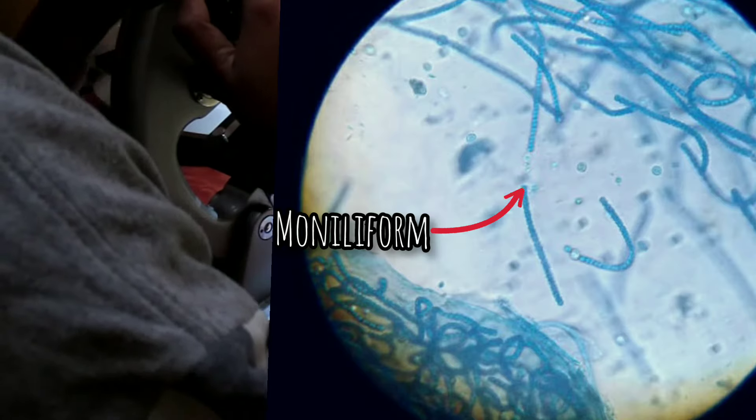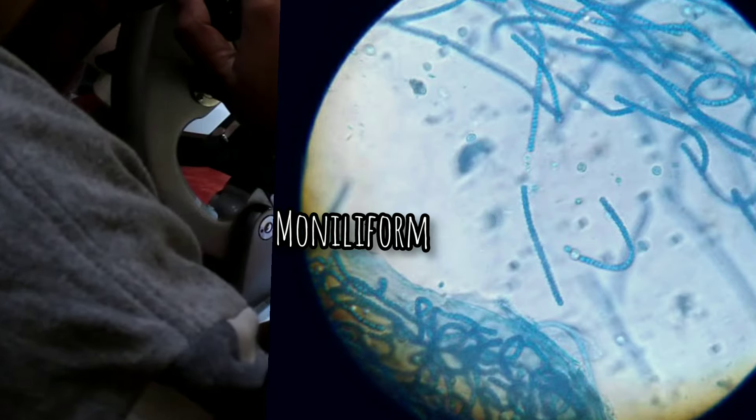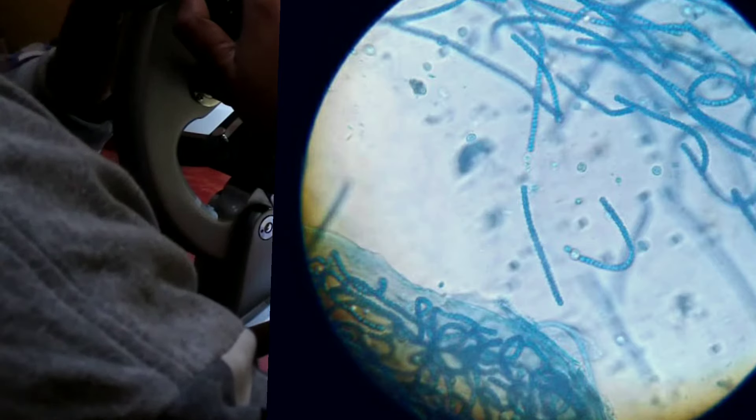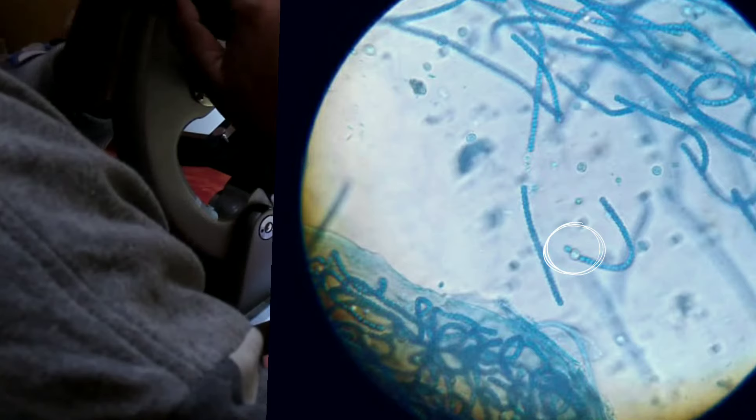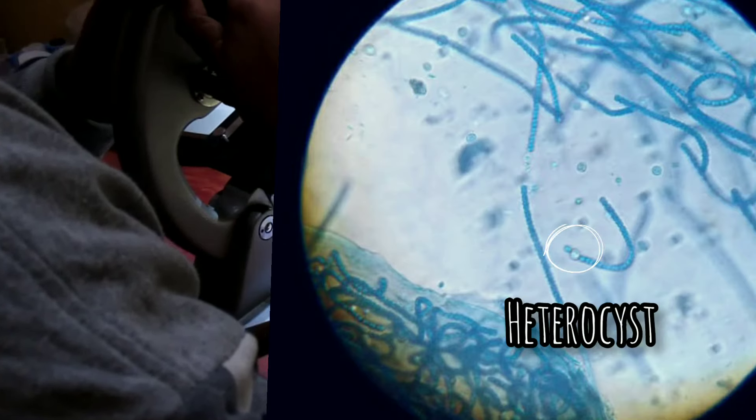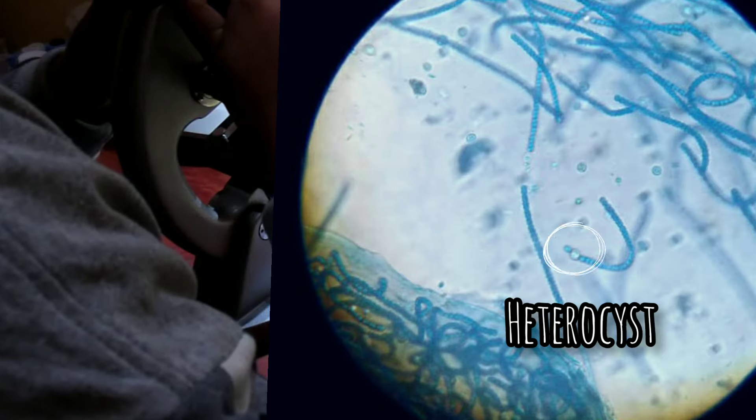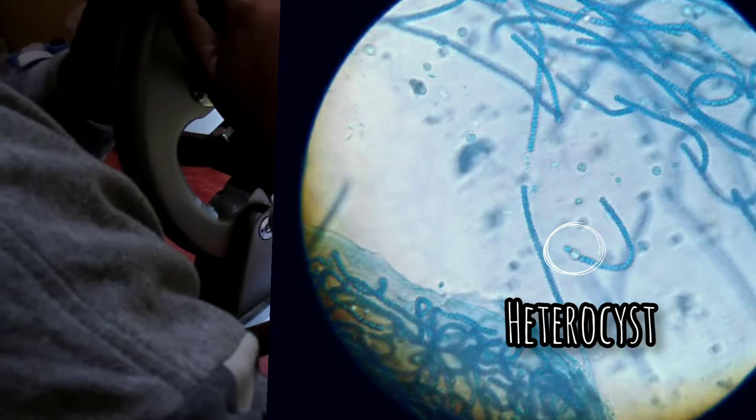In a filament, all the cells are not alike but at intervals are found slightly larger rounded and thick-walled cells having transparent contents. These are heterocysts. The heterocysts are commonly with two polar nodules and intercalary, but rarely with one polar nodule and terminal.